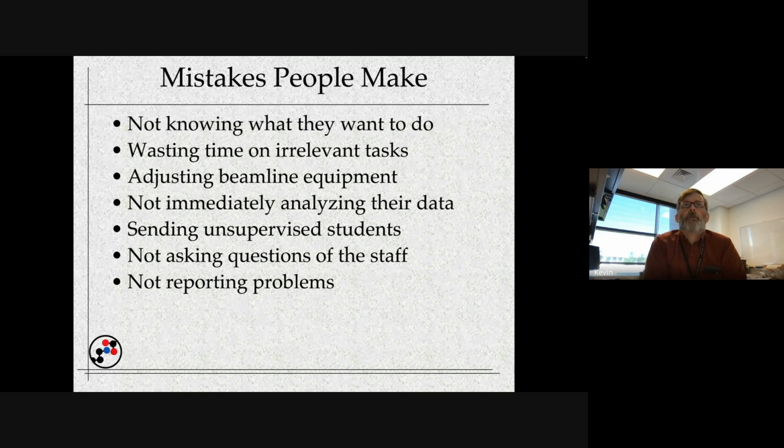So as a quick summary, I think using the synchrotron really can make a major contribution to anybody's research program. You can do experiments here that you just cannot do at home on a home source, so it's definitely a facility that people need to be aware of and not be shy about wanting to use.